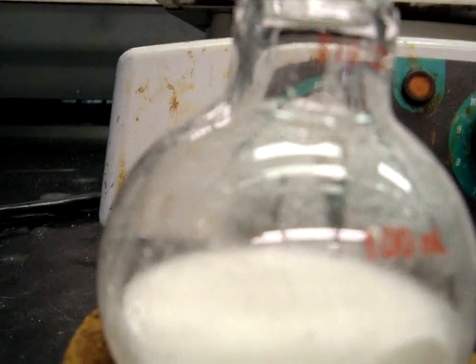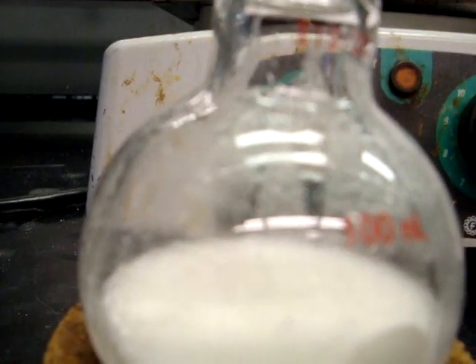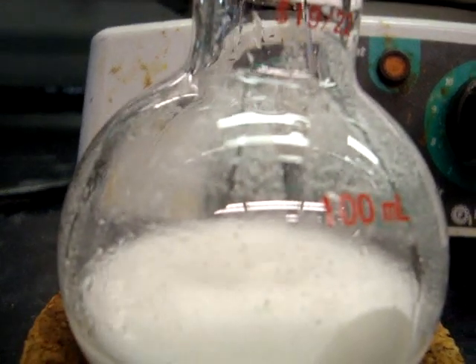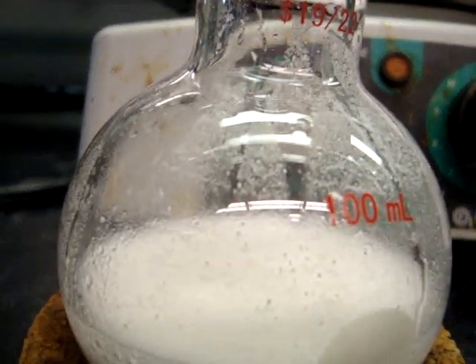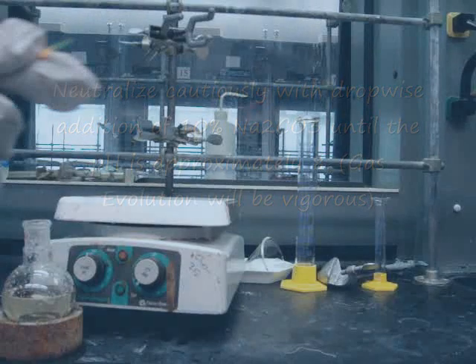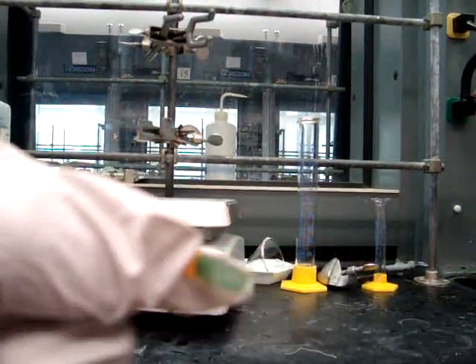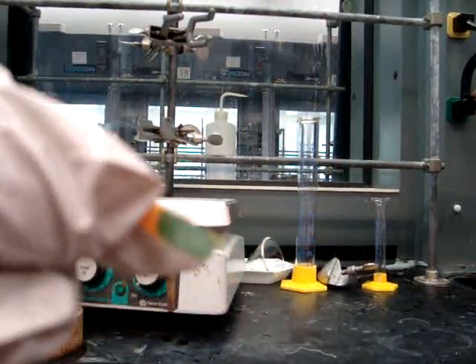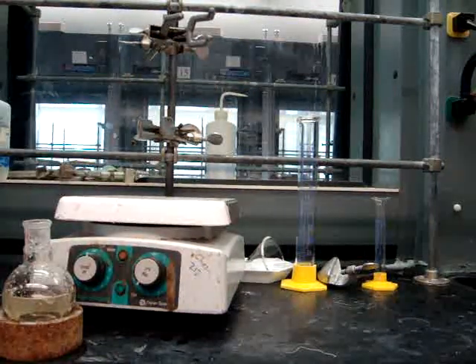You will add enough sodium bicarbonate so the pH of the solution is approximately 8. As you can see, when you add sodium bicarbonate, the reaction mixture will bubble. The pH paper will turn a greenish color when the pH is approximately 8 — this means you have added enough sodium bicarbonate.